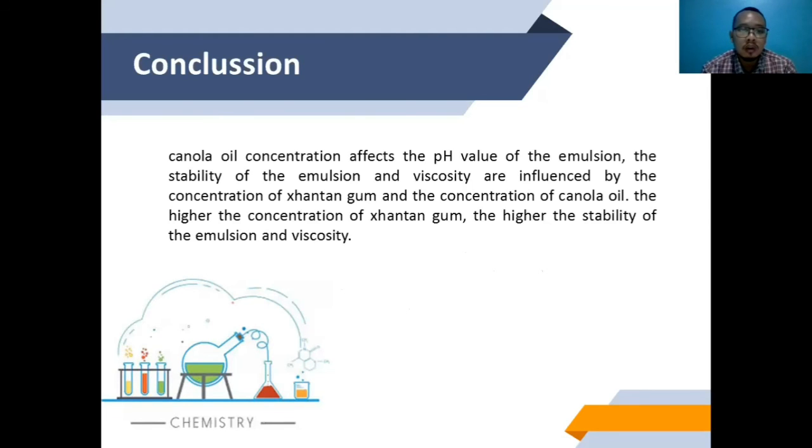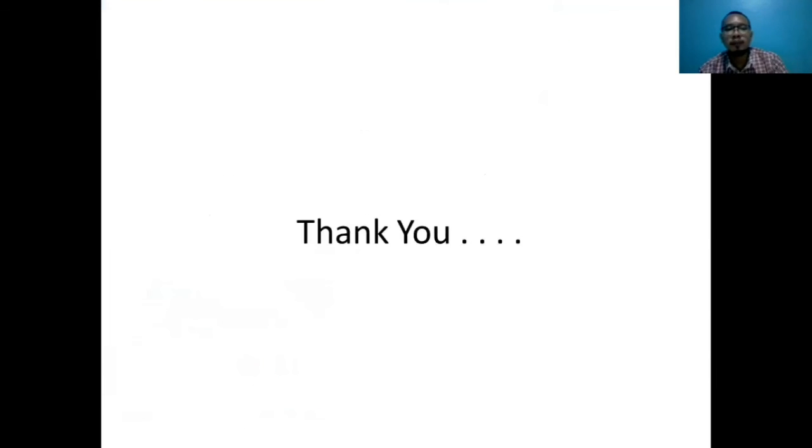Conclusion. Canola oil concentration affects the pH value of the emulsion. The stability of emulsion and viscosity are influenced by the concentration of xanthan and the concentration of canola oil. The higher the concentration of xanthan, the higher the stability of emulsion and viscosity.